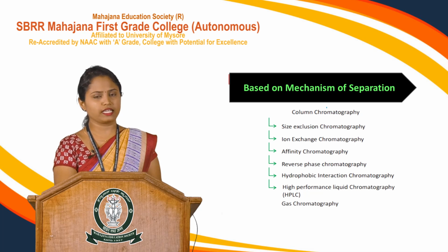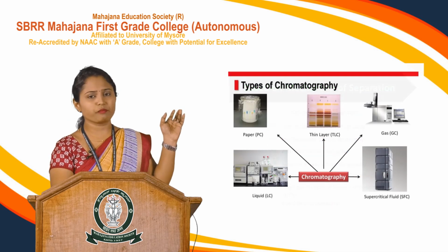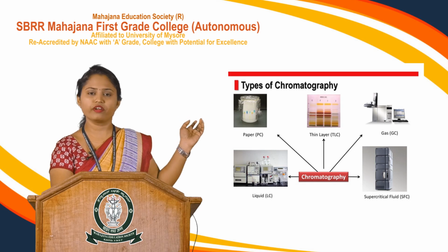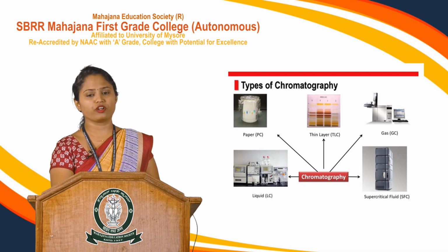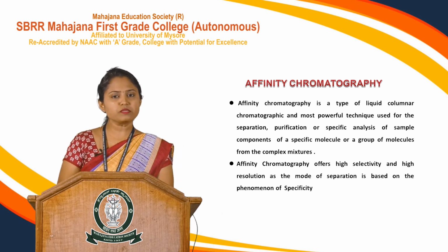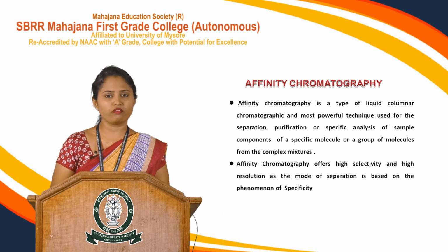So, out of all these techniques, in today's session we will be focusing on one of the types. You can look over the next slide, which represents paper, TLC, columnar, and up to the advanced levels of different kinds of chromatographic techniques. And now, we will be focusing on one of the important columnar chromatographic techniques, that is affinity chromatography. So, let us focus now. What is affinity chromatography? What is the principle behind affinity chromatography, or how can a molecule or an analyte be separated or isolated using the affinity chromatographic technique?